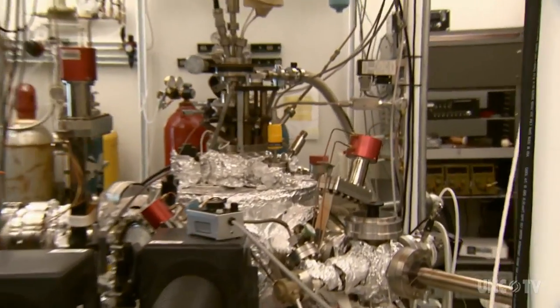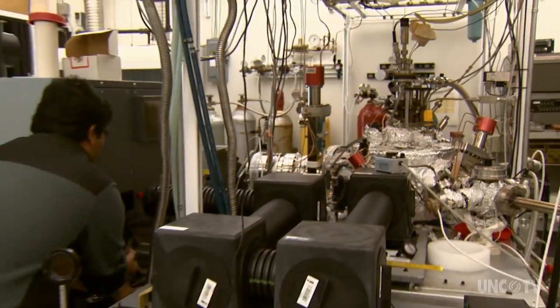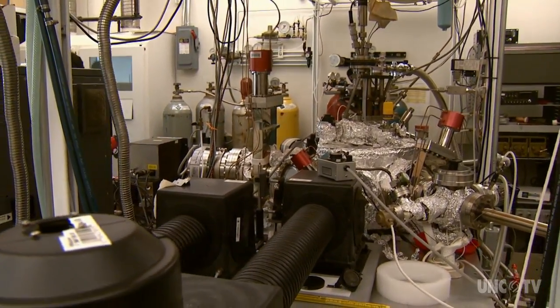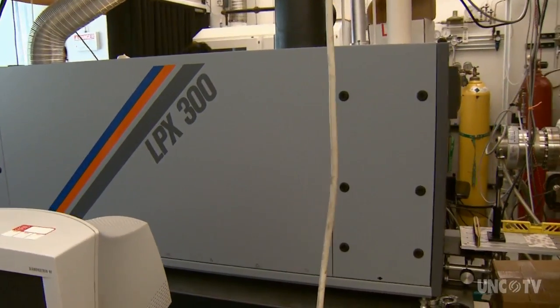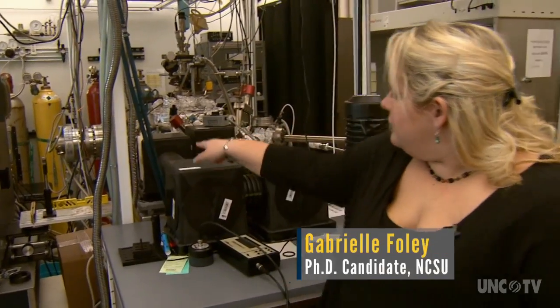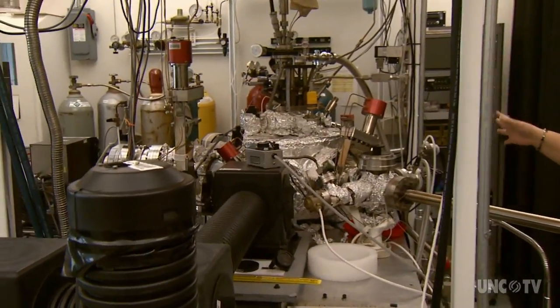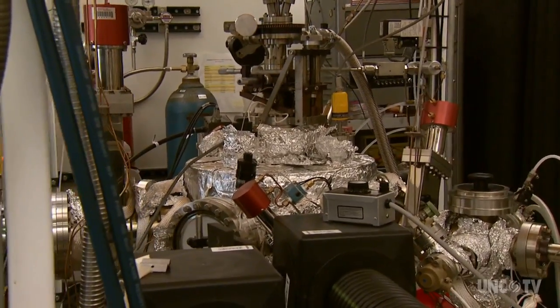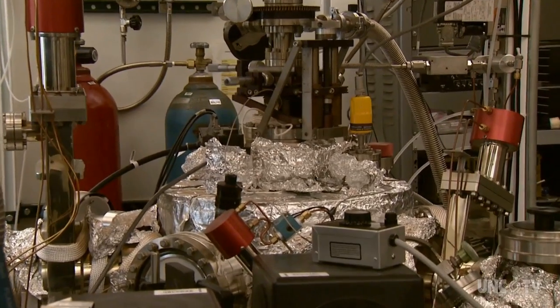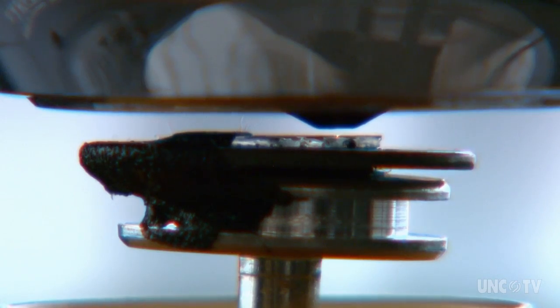You could say the device resembles a cross between a time machine, a relic of heavy industry, and a kitchen on steroids. This is a vacuum chamber, and this is where we do the laser MBE. The laser is actually over here in that large box where you see the danger sign, and it comes out of a small window in the front and travels through a series of mirrors and paths into the actual vacuum chamber. We keep the vacuum chamber at a very low pressure — about 10 to the minus 7 torr — and we keep our samples and targets in here.